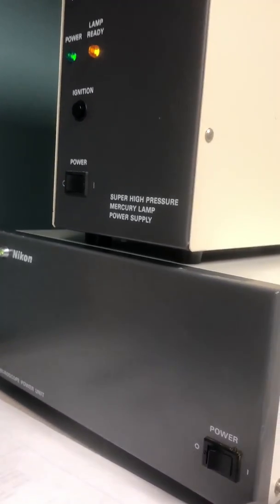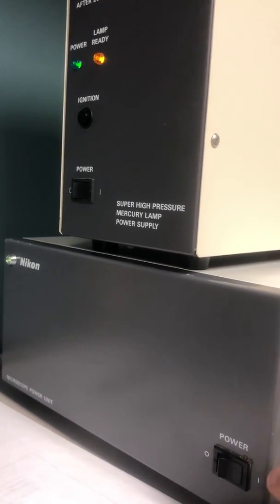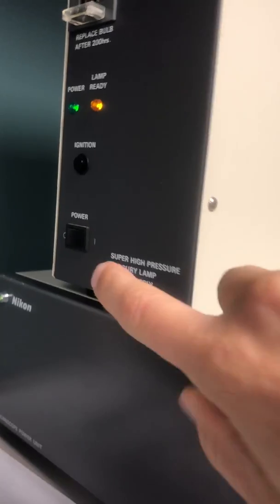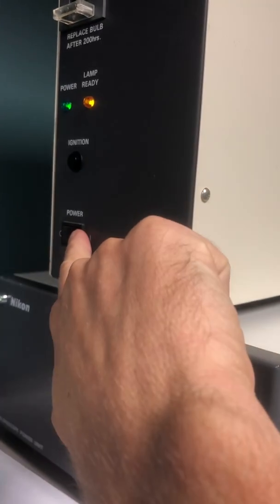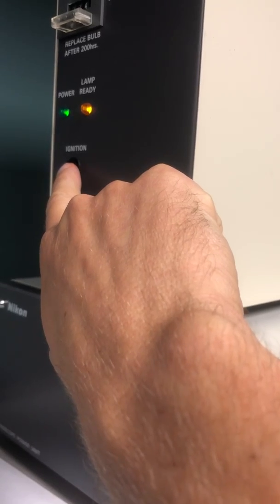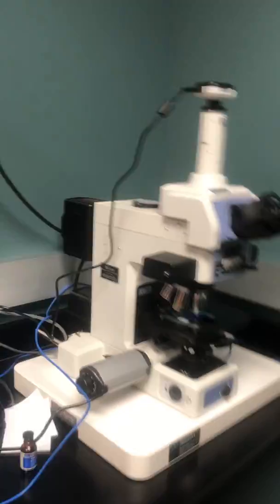So hopefully these lamps are turned off when people leave so that the bulbs aren't burning out. But this lamp right here will turn the bright light on, and this lamp right here is for the fluorescence. So you turn both of those switches on, and for the fluorescence you also have to press the ignition switch. And then after a few seconds you'll see the lamp ready will come on. And so then that allows you to view the fluorescence.